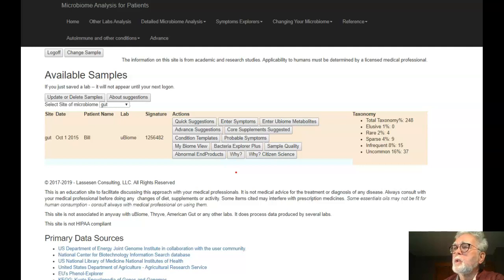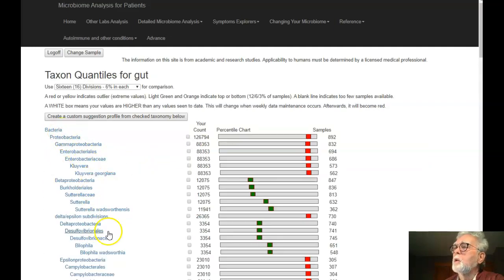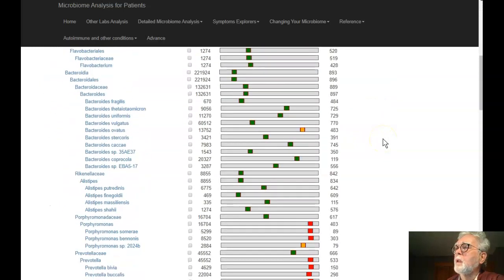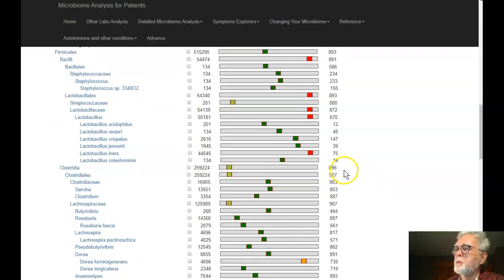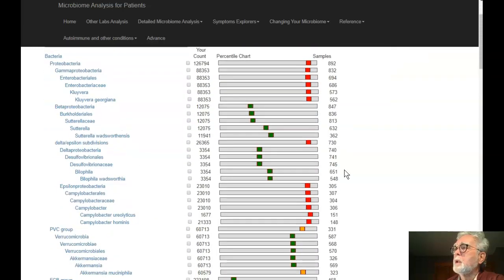What I should first do is introduce you to some of the issues involved. The best way of seeing it is by clicking on my own view, which will show you all the bacteria reported, what your count is, and relatively speaking where you are. If you hover over, you will see that you are, for example, in the above the 94th percentile — 94 out of every 100 people have less than you — meaning you have an overgrowth of this particular bacteria and would probably want to reduce it. Scrolling down shows relative position; you can also see where you are lower, or at pretty much zero.